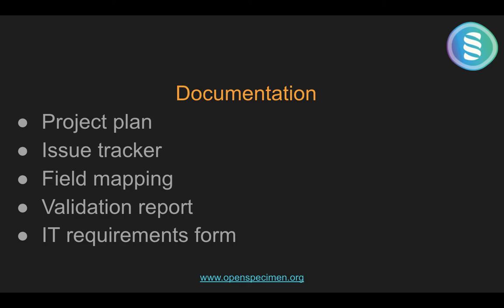The next important part, as I mentioned earlier, is the validation report that you will receive as test results from OpenSpecimen. For all your IT requirements, we have specific forms. Just to give you an example, if we want to do single sign-on setup, then we will have a predefined form for SAML and another for LDAP. All the requirements will be captured with these forms, and this is how we will progress.